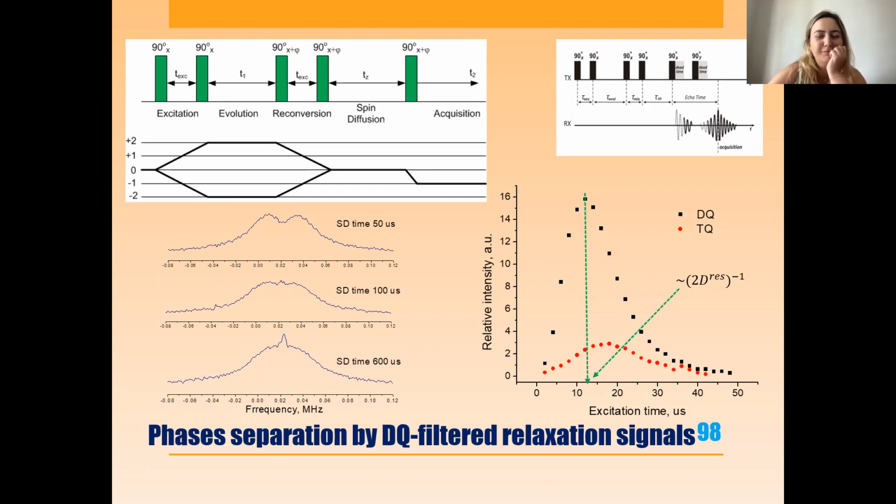Okay, thank you. So that is the reason. If you don't see a long component, that's great. It means that we completely killed magnetization in the soft part of the sample.